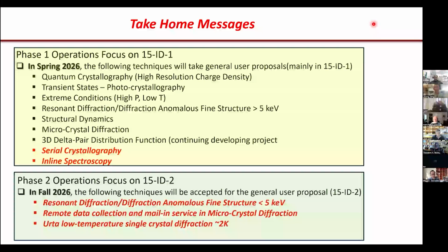Yeah, and on 14 BMC, we would try to go as large as 1 millimeter high, but that's out of the question these days, I'm sure. Yeah, 14 BNC, I don't know. The 14 BNC now pretty much we cannot use. Right now we can, but it looks like it's dead, right? If you do not want to use it, we can arrange for other beamlines, but I can talk to you in the other time, right? We can discuss.